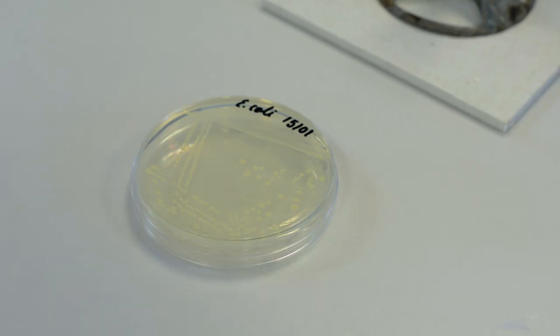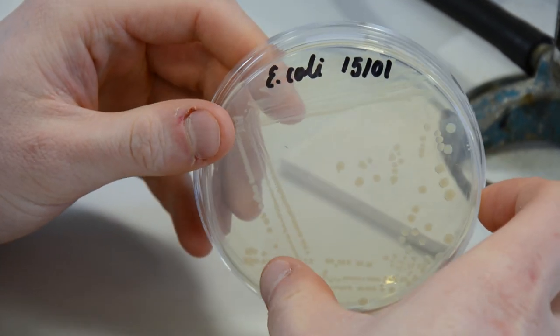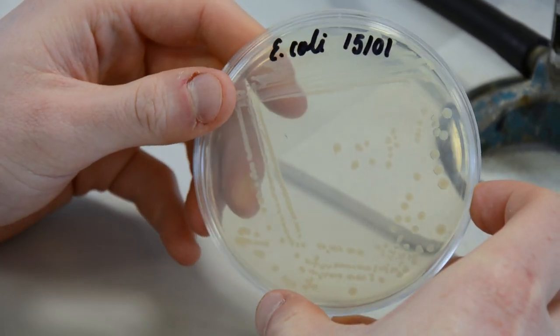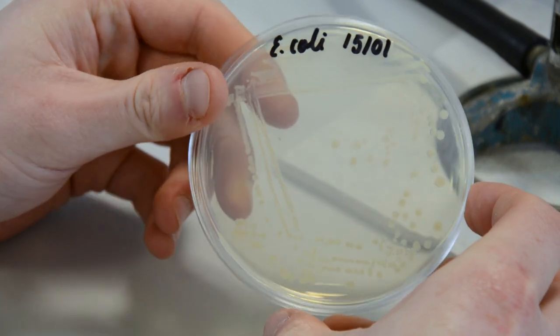After incubation, there is a pattern consisting of bacterial growth. As the distance from the initial inoculum increases, single colonies are visible. Single colonies originate from a single bacterial cell. This means that all cells in a single colony are usually identical.